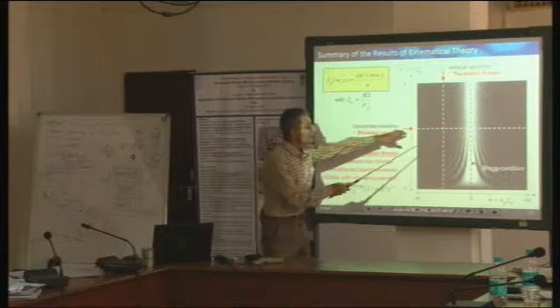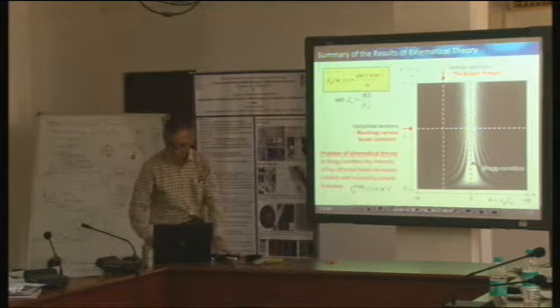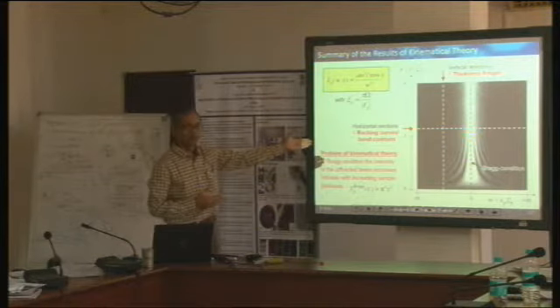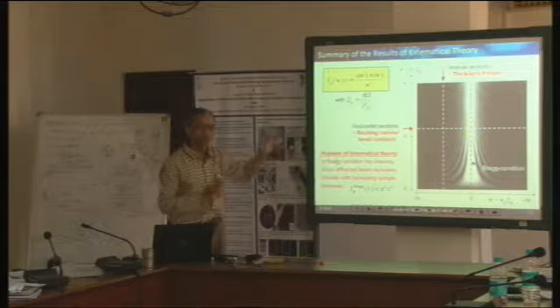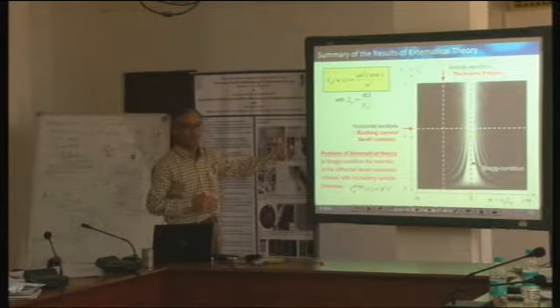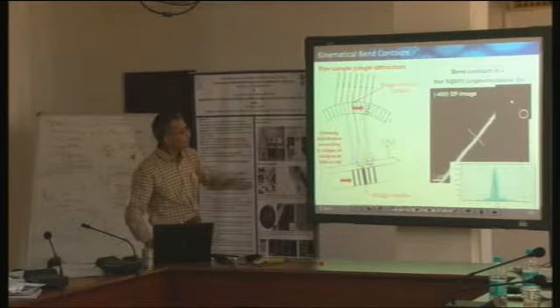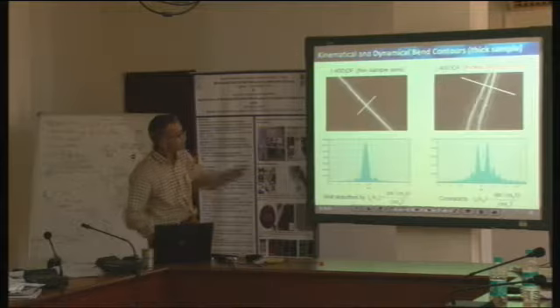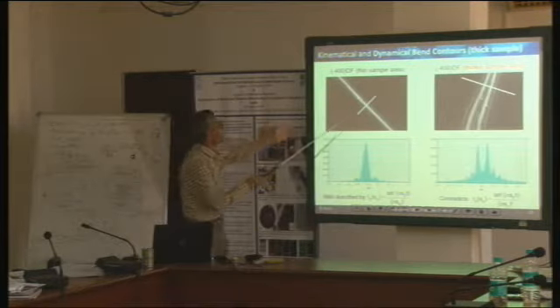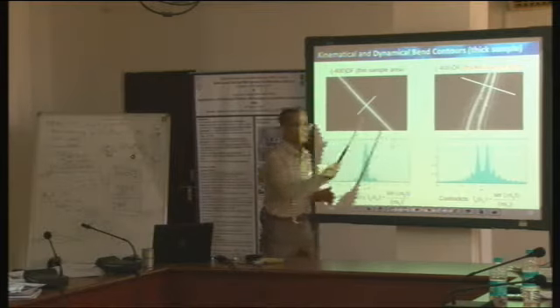When the sample is thin, this holds good, as we have seen in the experiment, because we made the assumption, derived the equation, and made the plot. This is super fine, but it has value only when it matches what we observe in the image. Here it is matching, but there are places where it won't match. This is the example. This is the case where it is matching, a thin area of the sample. This is the case where it is a thicker area of the sample.